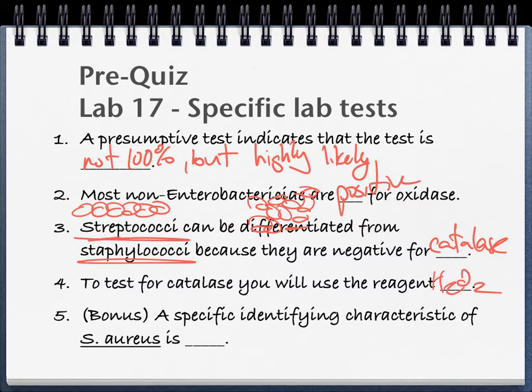It's nice and simple. Amongst the staphylococci, there's one specific bacterium, Staphylococcus aureus, that is always troublesome for us, right? Many tests have been used to identify it. What specific characteristic are we going to look for in this case? Coagulase. Good. One word in this case would have sufficed. But this enzyme called coagulase, yeah? Which separates it from the other non-pathogenic bacteria. Questions?